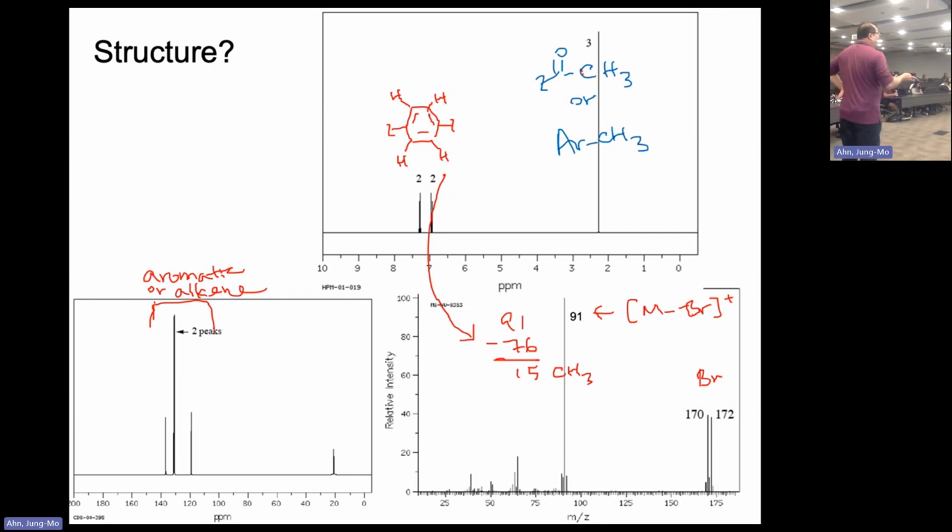But in case, you have to make sure that the methyl group shows up here. That would make it a benzylic position. That benzylic hydrogen will show in the 2.5 region, so that totally makes sense with this chemical shift of the peak. I know a carbonyl could put it there too, but we don't have to consider the carbonyl, because there's no way another carbonyl shows up here. So one bromine, one methyl, we put around the benzene, and that will be all the pieces together. So that's this one. So that's a pretty simple question.